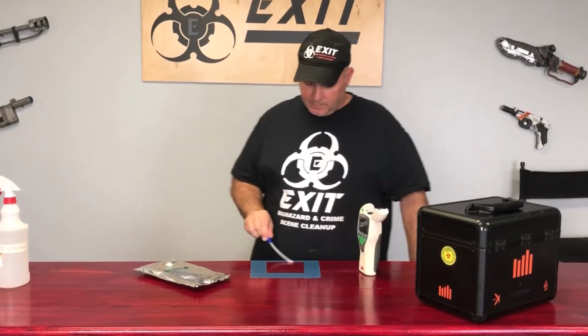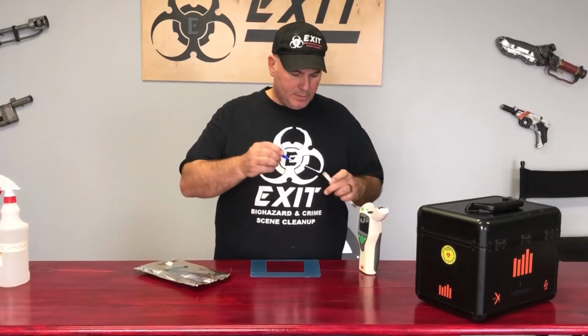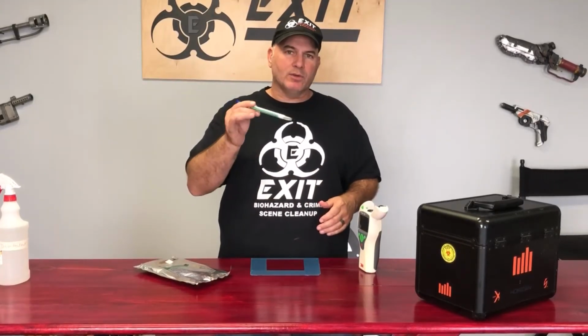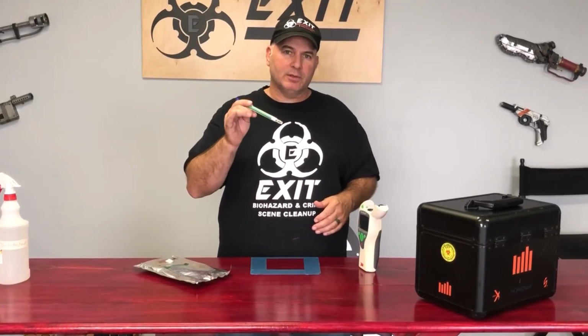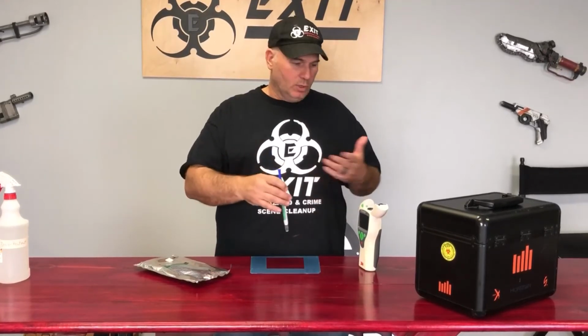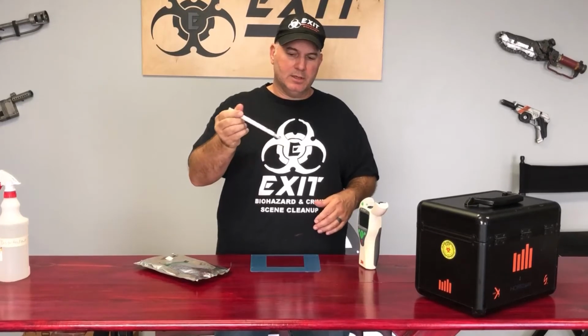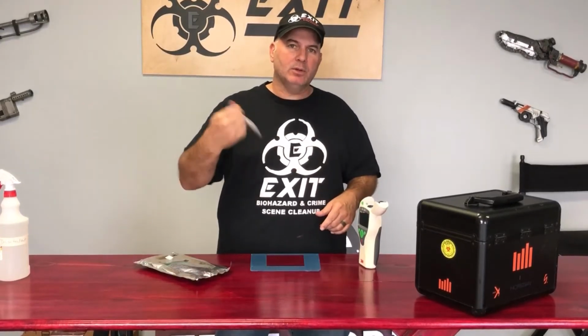All right, let's pop this in here. I almost put it in the machine that way. Okay, now you have about 4 hours till you have to use this, okay? But we're gonna use it now, so we're gonna crack it. All right, you see the little swab went in the liquid. I'm gonna shake it up.